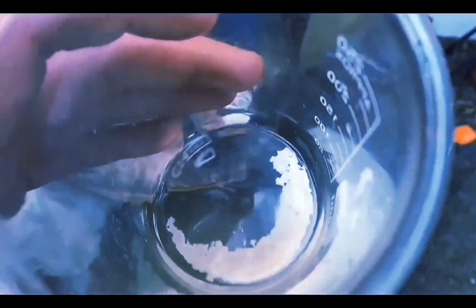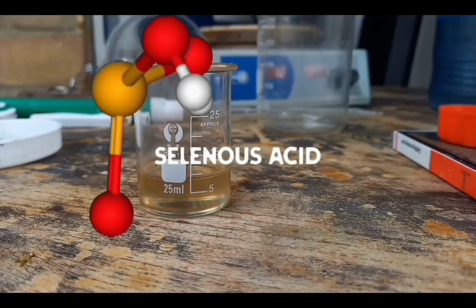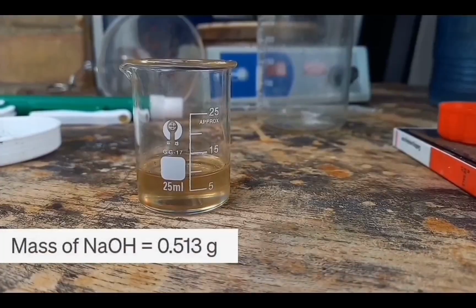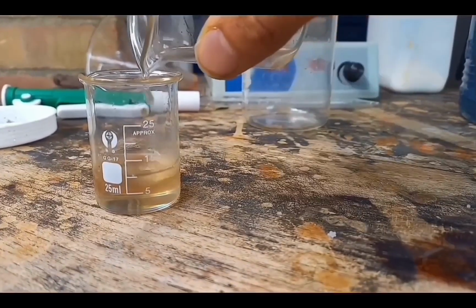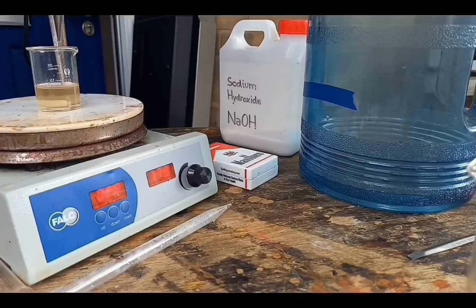To make selenous acid, you just need to add distilled water or deionized water. To that, you add a stoichiometric amount of sodium hydroxide to get sodium selenite. You can test for this using silver nitrate. You will get a white precipitate.